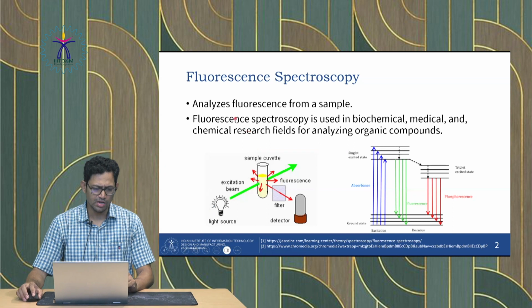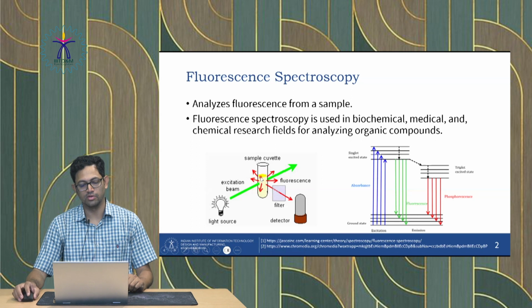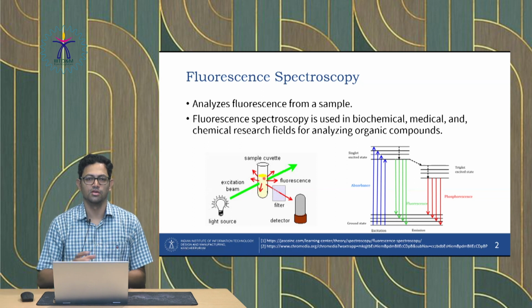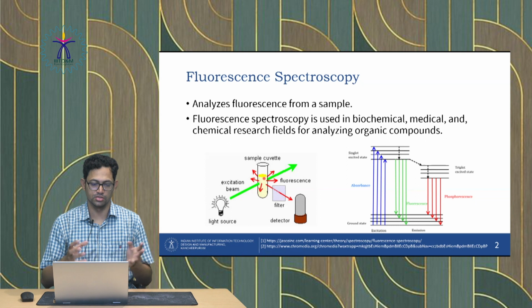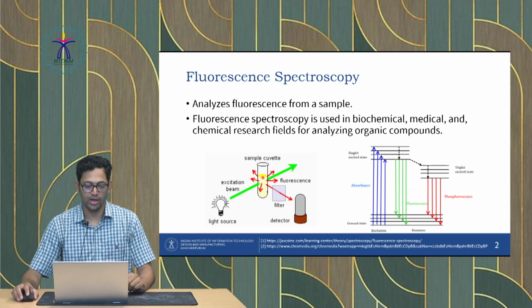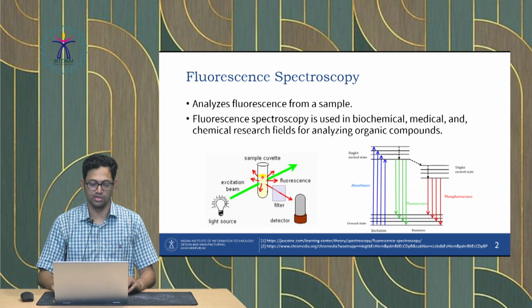When you see fluorescence spectroscopy, you have this sample cuvette, and we pour the sample within this cuvette. That is one of the important aspects of fluorescence spectroscopy. Everything is based on the sample material, whether we apply some kind of dye in the sample which binds to the analyte for making a biosensor, which we will see in some time, or there is some kind of endogenous fluorescent dye already present within the sample itself.